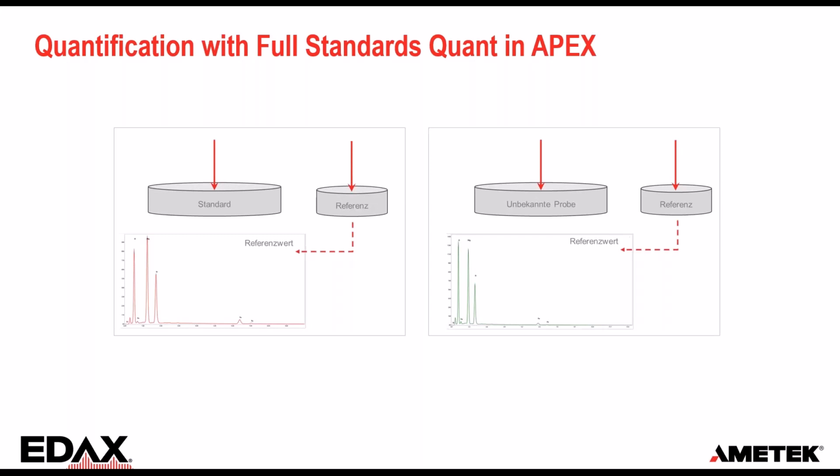The most important point here is that by separating these measuring systems, the standards can be stored, and I can apply quantification with standards in post-processing also on an offline system. The standards can be used for all the samples as long as the acceleration voltage is identical. If the standard and the unknown are measured on the same device, the detector efficiency will also be accounted for.